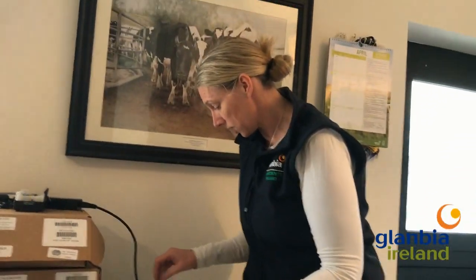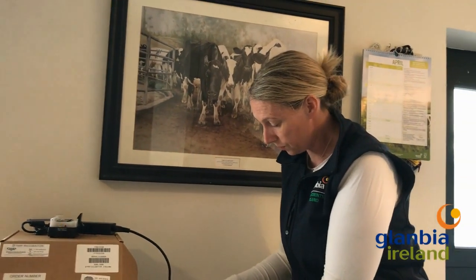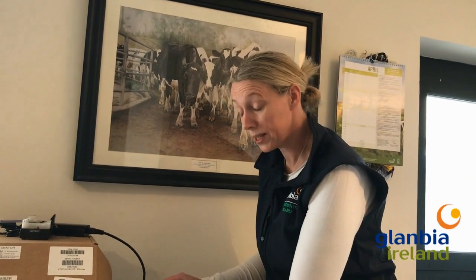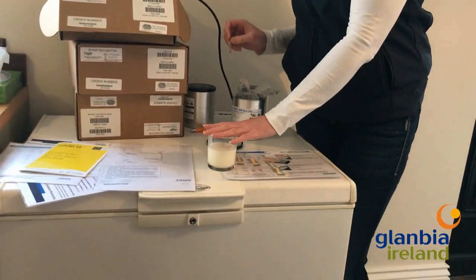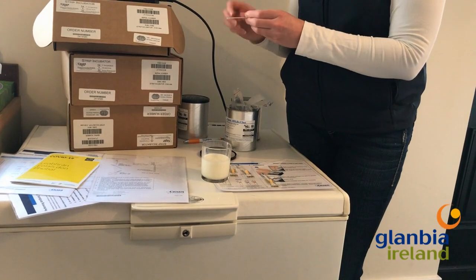I'll give you a quick demonstration now. What you do is you take your sample of milk. Always have the milk cold, so even if you've taken it from an individual cow, cool down the milk first. Make sure your sample is well agitated and mixed.